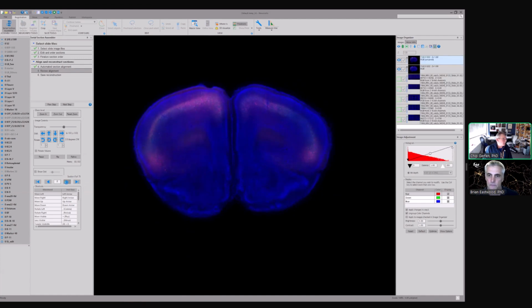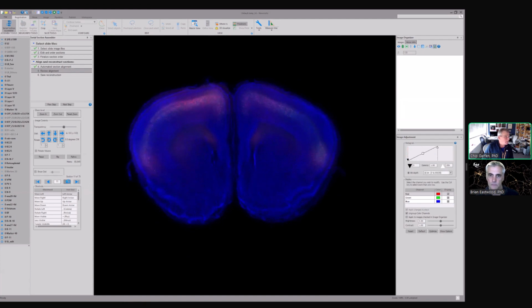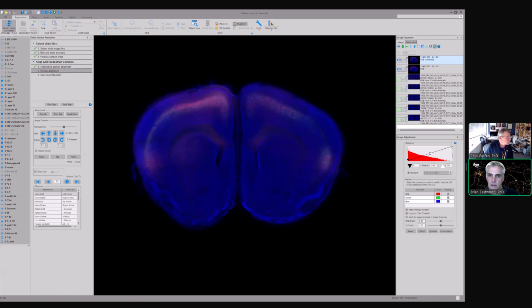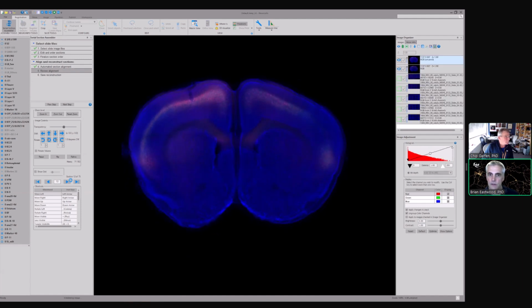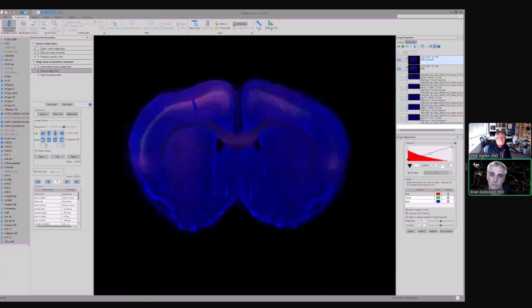And so this is another manual part of the process that's required. And after some time, this is another thing that only takes about 5 minutes usually to do. And I think here, the goal is just to check to make sure that there haven't been any sections that have been misflipped. And you can adjust the registration if you want to.